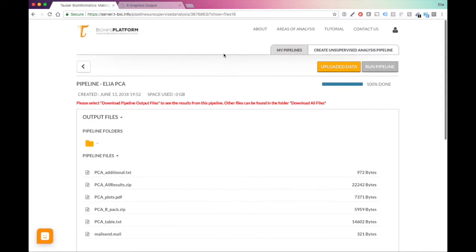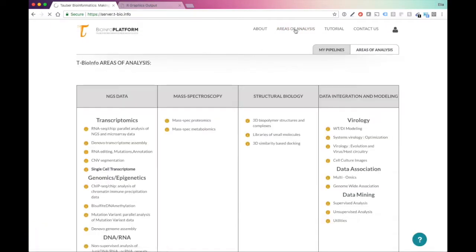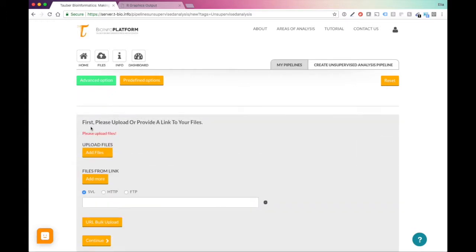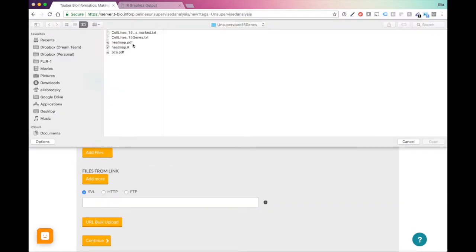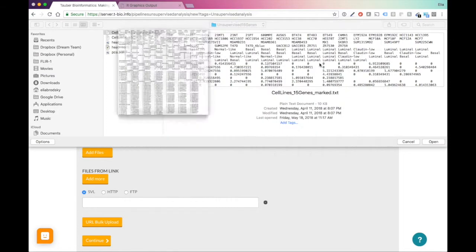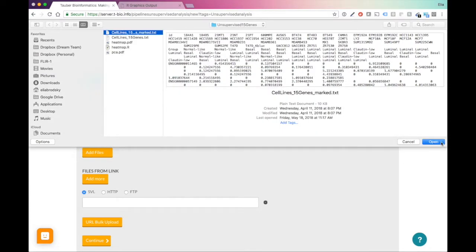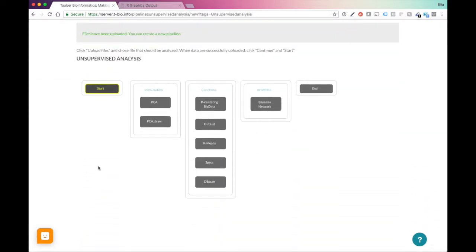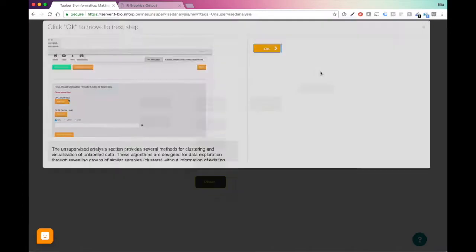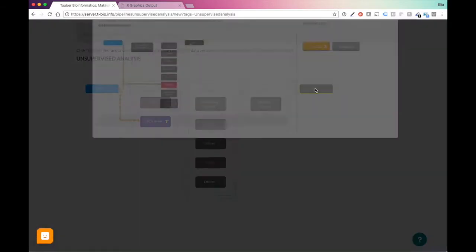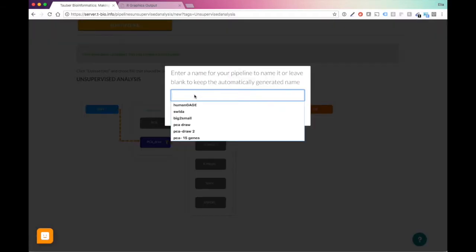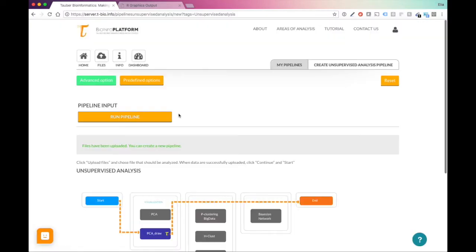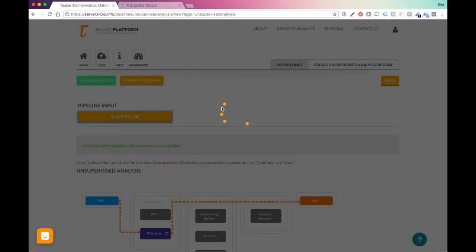Let's do this. Let's go back to areas of analysis, unsupervised analysis. We will upload a different file marked. Now you can see that for each one of these samples, we also have an annotation, what group they belong to. Let's do this. Let's open the file. Then it will upload. Press continue, start. PCA draw. Yes. And save. Now I will do Ilya PCA annotated, run pipeline.